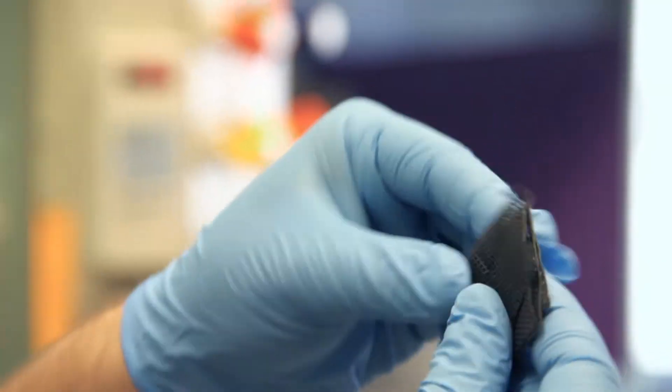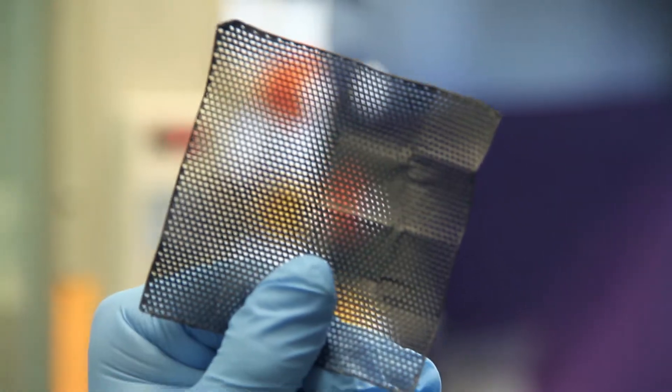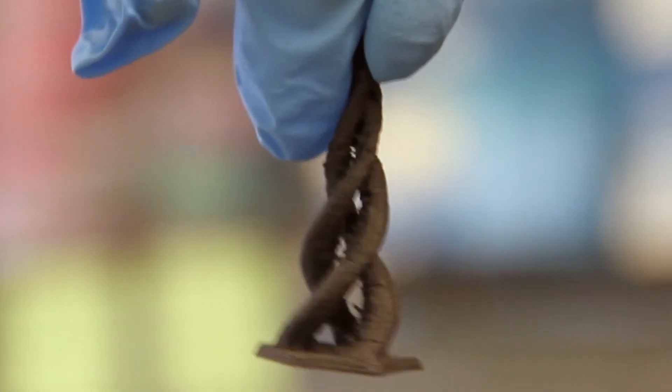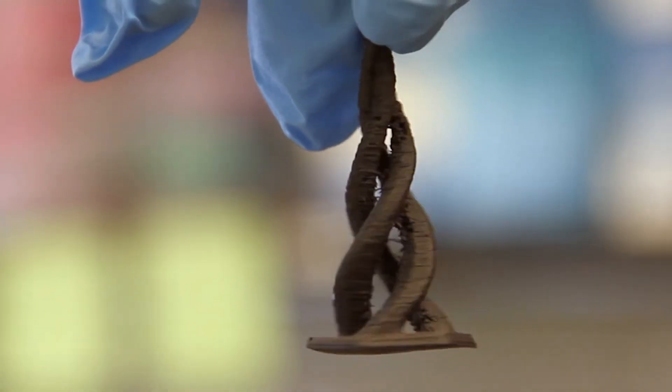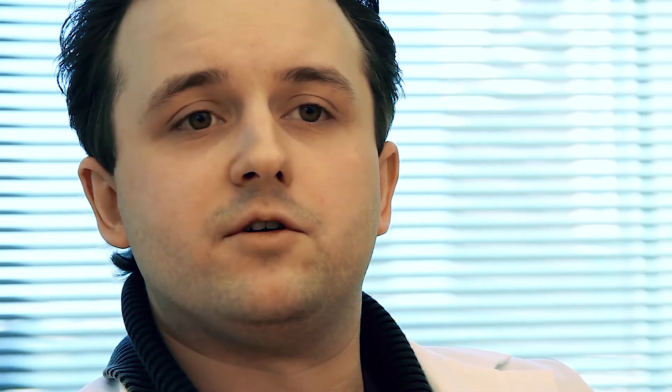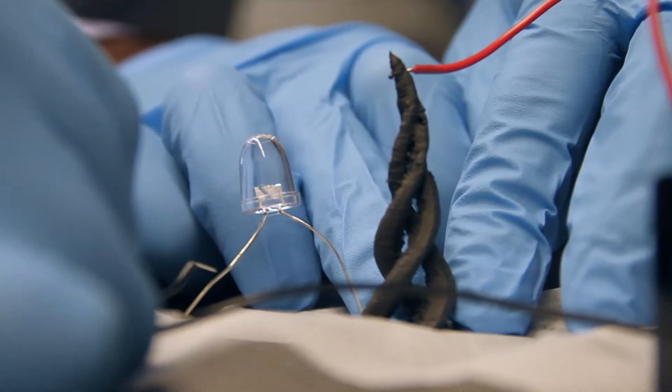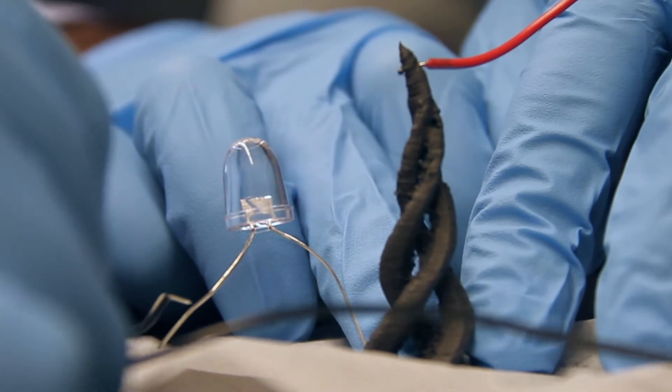With the 3D bioprotter, I've been able to focus on 3D printable materials development. The graphene work is quite interesting, and we're using this material to regenerate nerve tissue and muscle tissue in the future. It's a very promising new biomaterial with great electrical conductivity and potential for non-biological applications like electronics and energy.